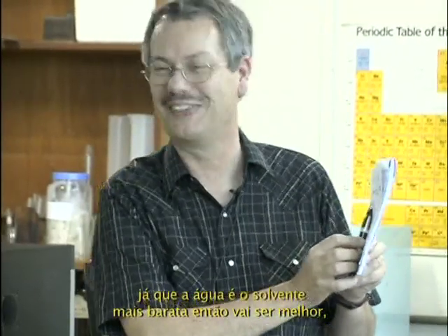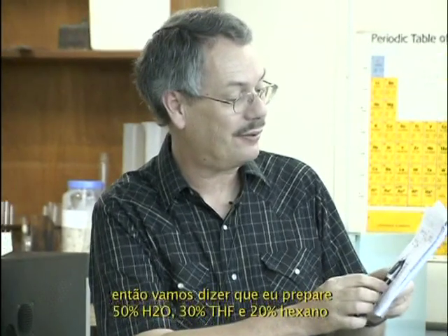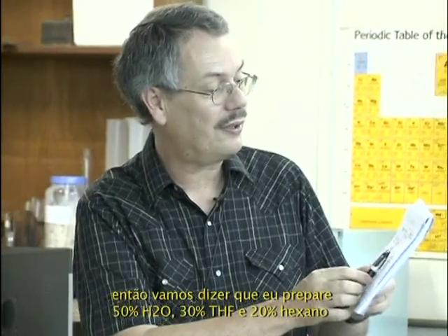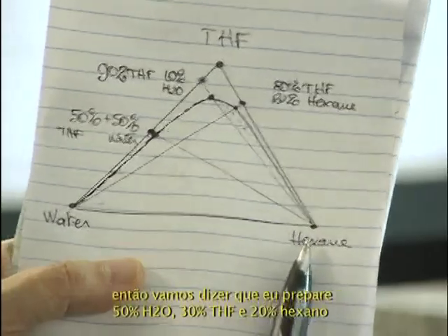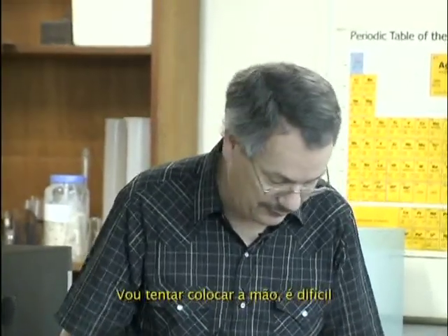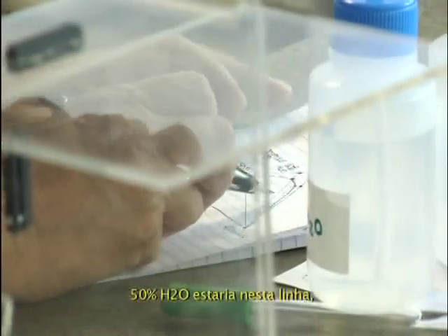That would be better. So let's prepare 50% water, 30% THF, and 20% hexane. I will try to put it by hand, it's difficult. 50% water would be on that line.